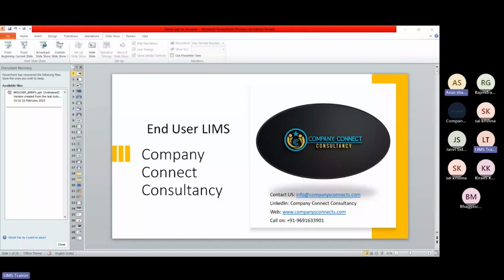So welcome everyone. Today we will have a demo session on end user LIMS, Laboratory Information Management System. In this demo we will cover short details which will be covered in detail in the actual course.